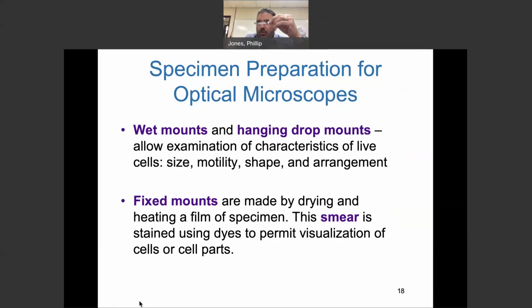So a lot of you, if you don't heat fix it, and I did it myself. So once again, in lab, if you mess something up, don't get embarrassed, don't get all red, don't start sweating, because whatever mistake you made, I made it right over there in 1993 when I was in this very same room with Dr. Rowe. So whatever mistake you make, I've already done it. Trust me. If there's a mistake to be made, I've done it, and I've done it here.